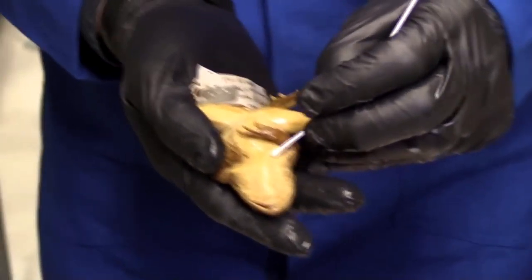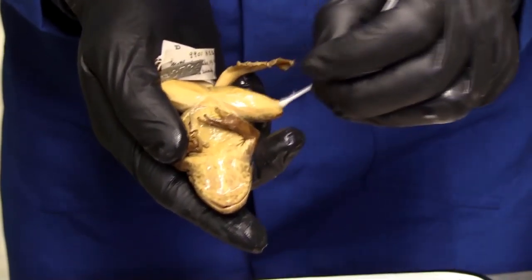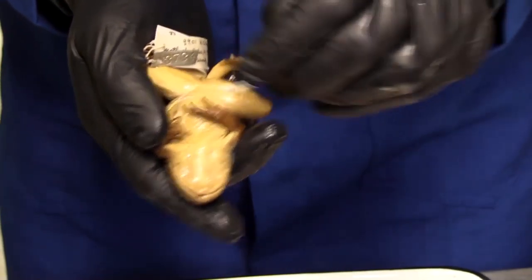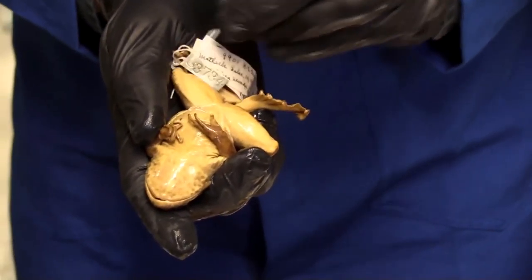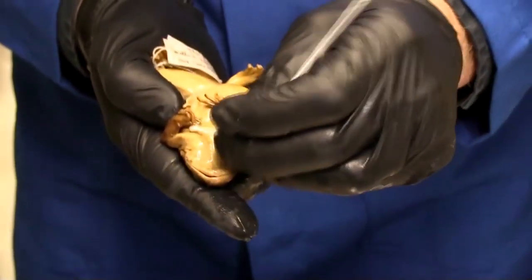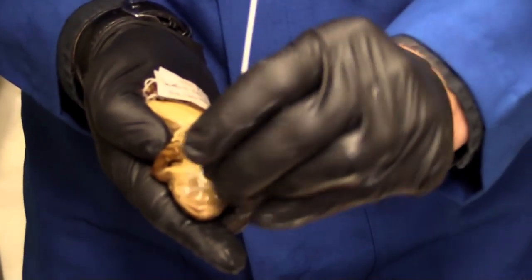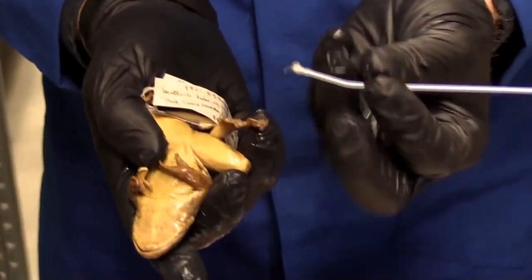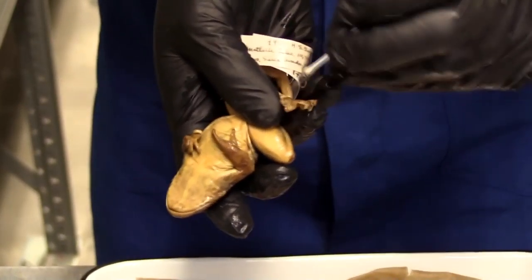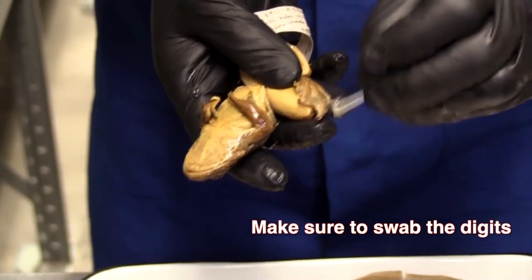Notice I'm bending the swab a little bit and twirling it. These are techniques that allow me to know I'm getting enough friction and covering space to collect skin tissue. It's okay to continually rub across the whole animal, but those are the most likely places where we're going to find the infection. Finally, I'm also going to do a little bit in the webbing of the back feet.